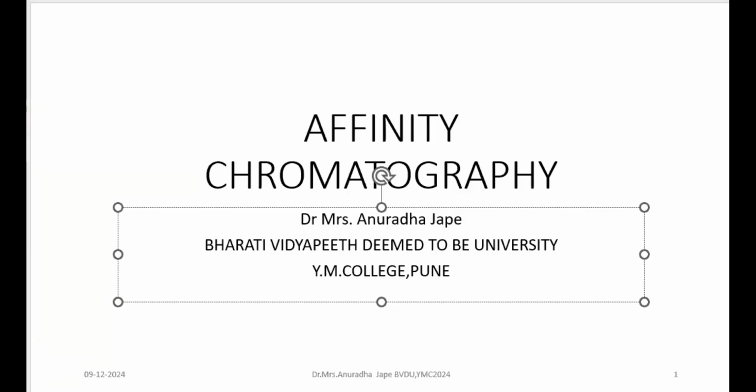Hello. Today's topic is affinity chromatography. Introduction to the technique we have to discuss in today's lecture.